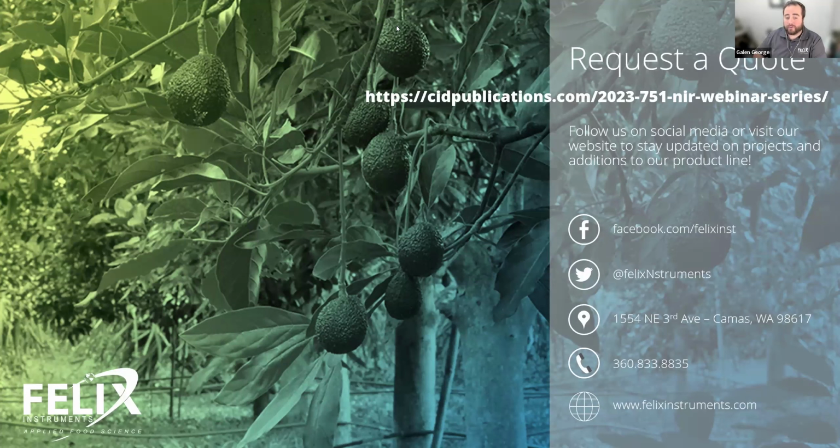And then the last question, I just got one more question here: does Felix provide software for development of new calibrations? And the answer is yes, we do. We have a proprietary software that we call App Builder. That is available for download from our website. You can actually go and download it right now if you wanted to. If you just go to the support section of our website and then choose the F750, you can find the download link for App Builder there.